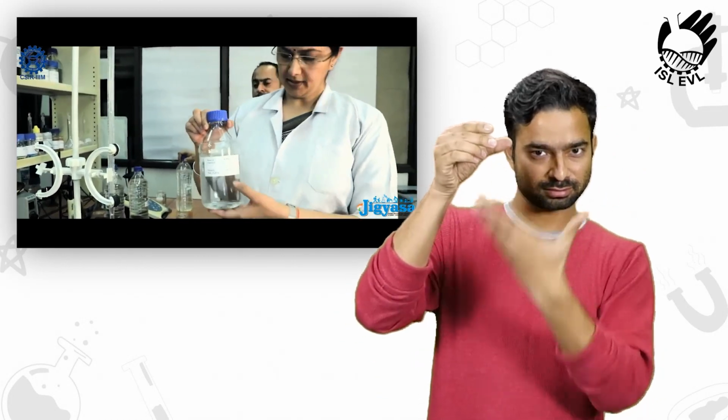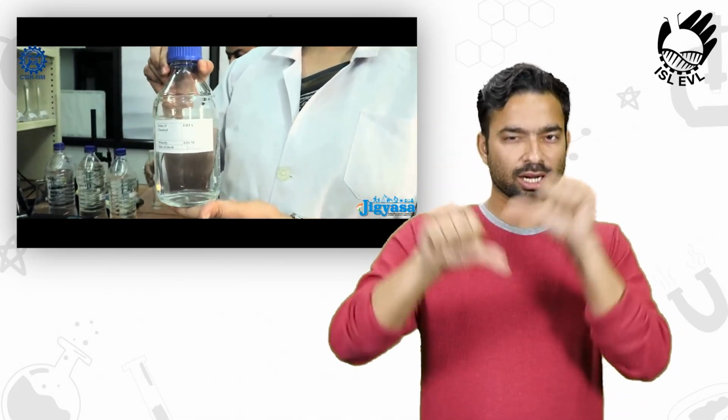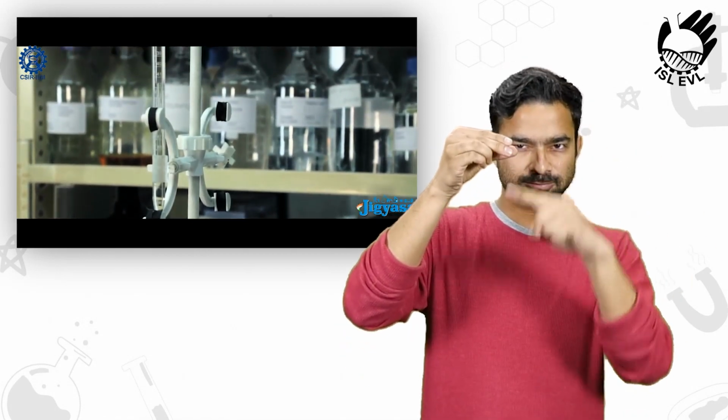Moving on to the next, we are going to see calcium using volumetric analysis. So this is our calibrated burette, and this is our secondary standard, 0.01 molar EDTA, ethylene diamine tetraacetic acid. So this is going to be filled in the burette.